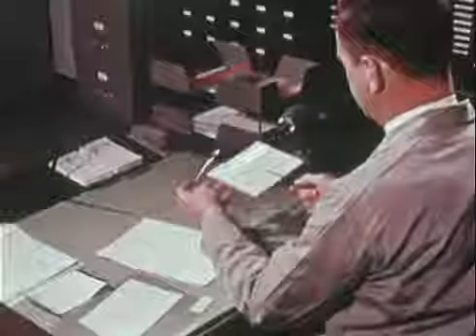Heavy-handed block printing, so often found on bank robbery notes, can leave an indent on the undersheet of the pad. In this case, the police were thorough in their search of the suspect's room and meticulous in the preservation of evidence found there. The examiner will have a specially lighted photograph made to back up his report on the content of the indentations.